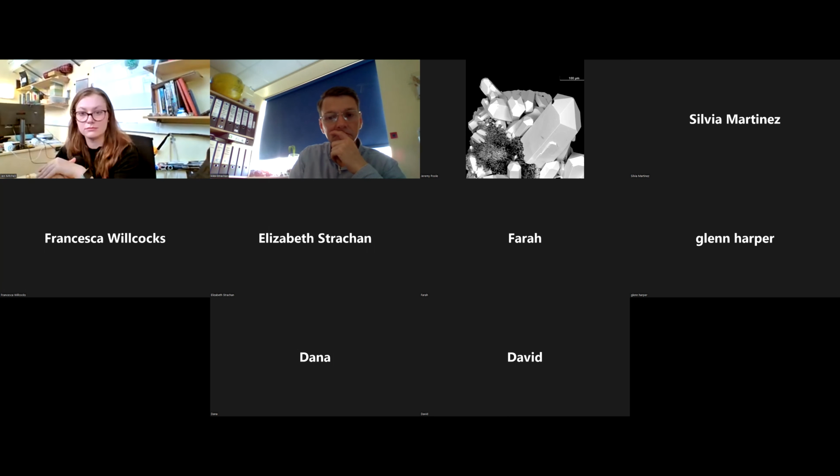What do you coat your materials with for EDS? You use carbon or gold or what? We use carbon. So carbon is electron transparent. If you want to do composition analysis, it has to be carbon or uncoated. So we aim for 10 to 15 nanometers of carbon. Getting a thin coat is pretty important. Having a good understanding of how your coater behaves and what thickness you're coating to is quite important.